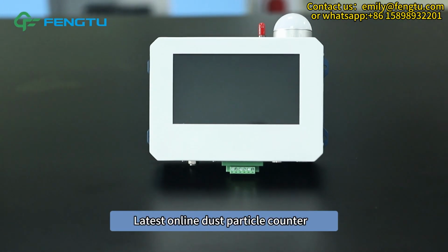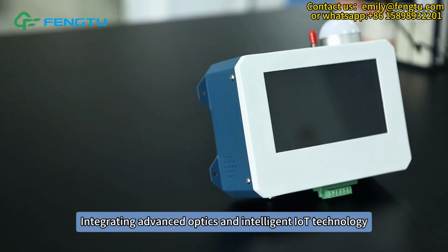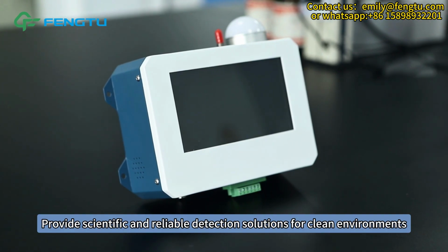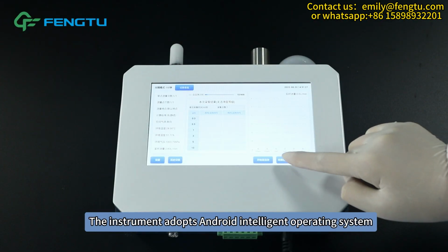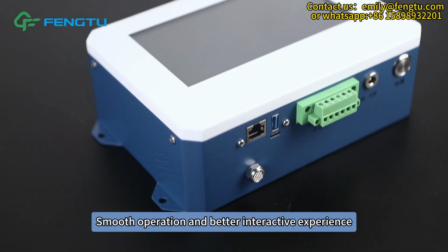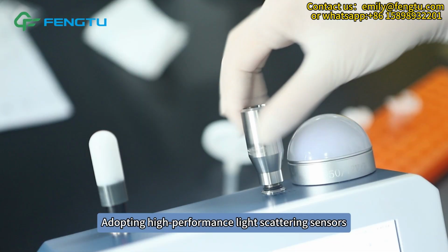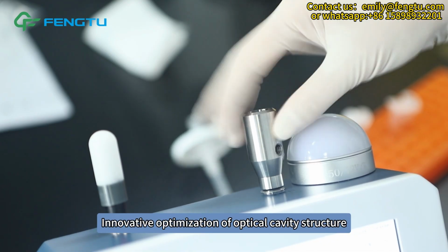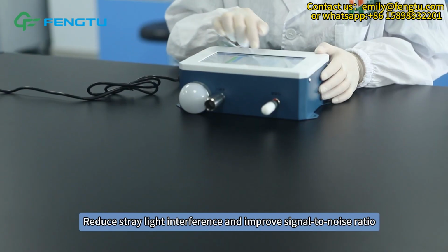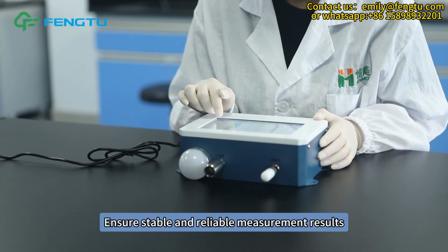Latest online dust particle counter, integrating advanced optics and intelligent IoT technology, provides scientific and reliable detection solutions for clean environments. The instrument adopts the Android Intelligent Operating System, equipped with a high-definition touchscreen, smooth operation and better interactive experience. Adopting high-performance light scattering sensors, with innovative optimization of the optical cavity structure, it reduces stray light interference and improves signal-to-noise ratio. Ensure stable and reliable measurement results.